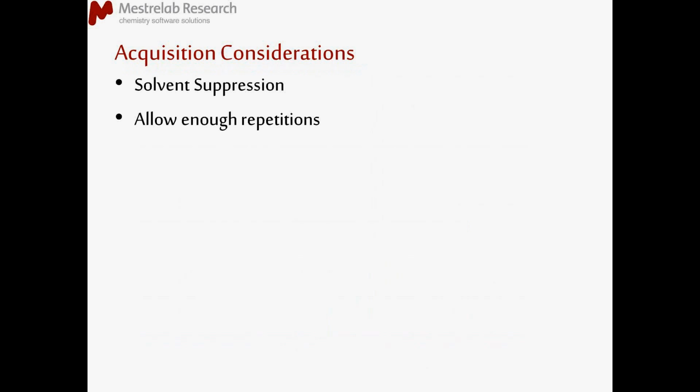This applies whether you are going to do this automatically or in a fully manual way. Next, and I'm sorry to have to say this, but I have seen this problem so many times by now that I think it should be mentioned. Please keep the same receiver gain if you can.